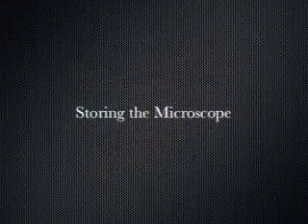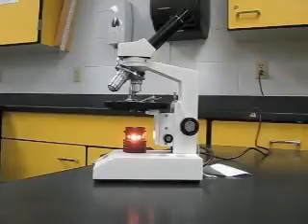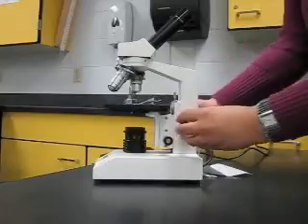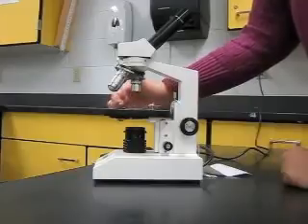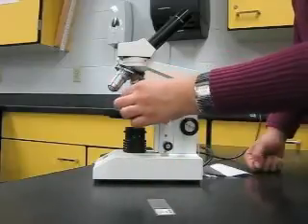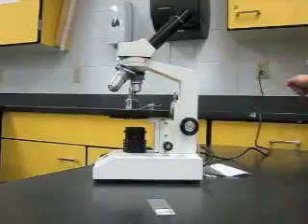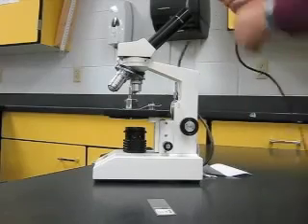Now finally, storing the microscope. When preparing to store your microscope, the first thing you'll need to do is turn off your light source. Next, lower the stage using the coarse adjustment. Make sure that you use the stage clips to remove your microscope slide. You can use the revolving objectives to make sure that the lowest power objective is in operation when storing your microscope. Remove the plug and wrap it securely around the base of your microscope.